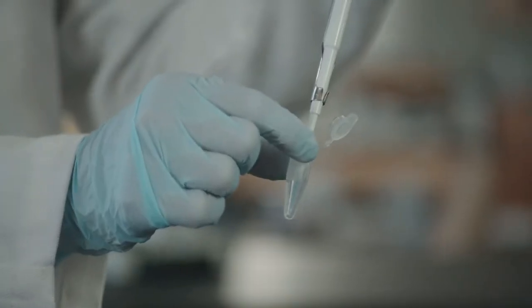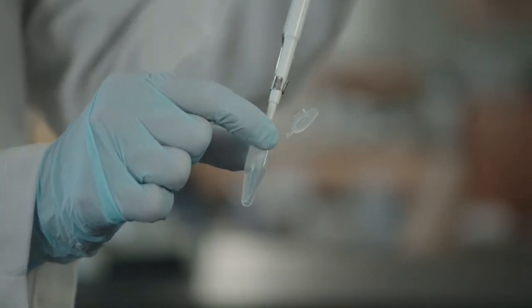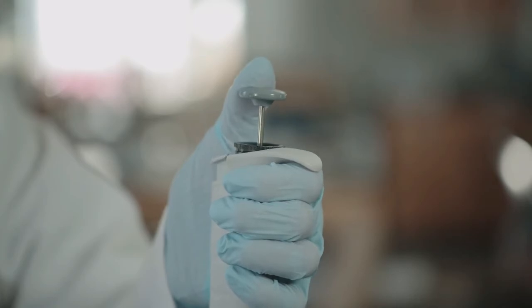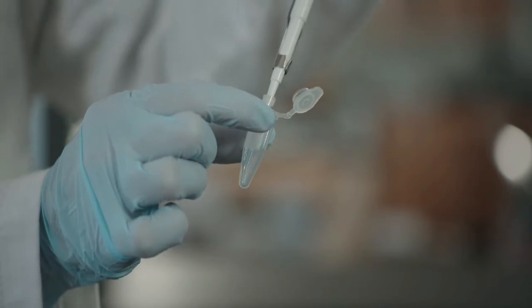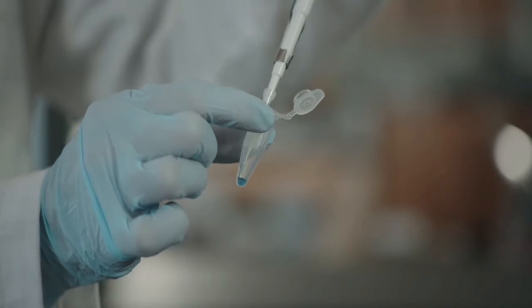microliters. To expel the liquid from the pipette tip, place the pipette tip into the tube in which you want to expel the liquid. Then slowly push down on the button at the top of the plunger. As you push down on the plunger, the fluid in the tip will be pushed out into the tube. Remember that the plunger has two stops, and that you push to the first stop when you are taking fluid up into the pipette tip.